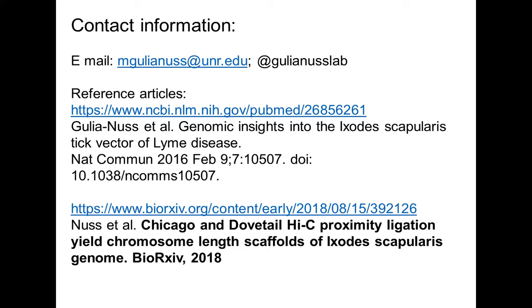Okay, thank you. Can I sequence your Hi-C libraries myself? Yes, you can, definitely. These libraries are standard Illumina libraries, and so you can sequence them on any of the Illumina HiSeq platforms. We use the HiSeq X10 when we do it for you at Dovetail as a service, but certainly we can ship the libraries to you, and you can sequence them, and then you would upload the raw data to Dovetail for the next step.